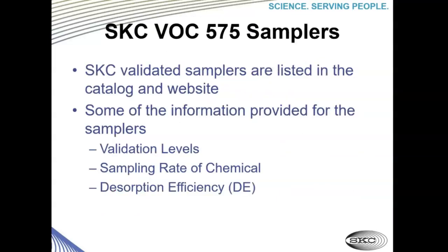A little bit about the 575 samplers. They're listed on the catalog and on the website. Some of the information provided for the samplers is going to include validation levels, sampling rate of the chemical, and the desorption efficiency.